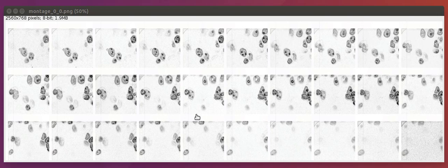The second thing that you should be aware of is that just like cells can be right next to each other in this two-dimensional image, when we're looking across a three-dimensional image stack, cells can be on top of each other as well. And when this happens, those two cells should be given separate labels. So an example of this can be seen here.